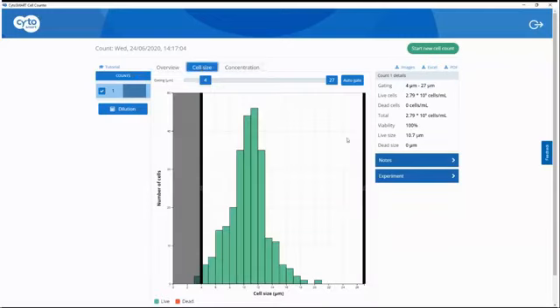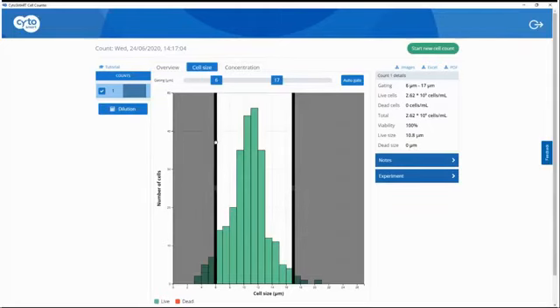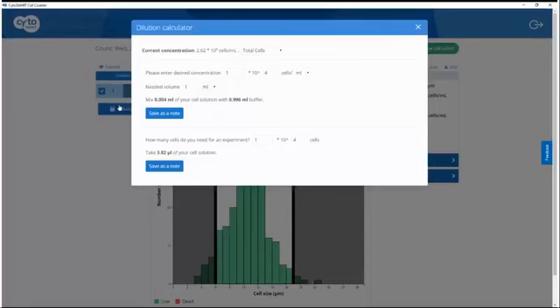So we can look at a histogram here too. I can adjust that by pulling on these little handles here. It's 100% viability. I have some with dead cells that I can show you too. So again, let's say that I'm satisfied with gating right here, and then I say I need, let's say, 10 mils at 1 × 10⁵. It tells me to mix 0.382 mils of my cell suspension with 9.6 mils of buffer. I can save this as a note.